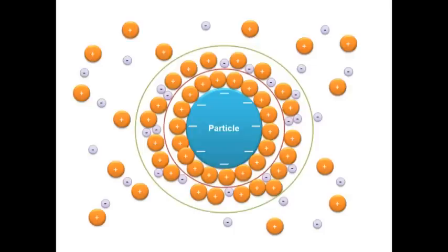These ions are overall a neutral charge. The edge of this double layer is called the slipping plane. Zeta potential can be described as the electric potential difference between the slipping plane and a point in the dispersion fluid that surrounds the particle.